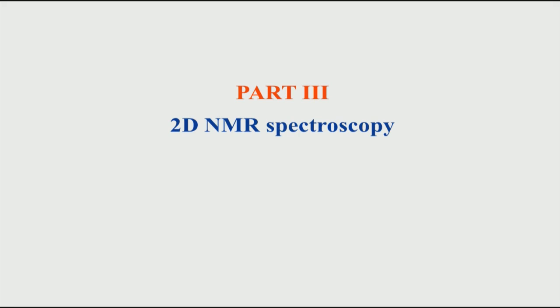From this class onwards, now we will move on to 2D NMR spectroscopy. Till the last few parts of the course we have looked at 1D NMR. So, now let us start with the important aspect of NMR spectroscopy, which is 2-dimensional NMR.